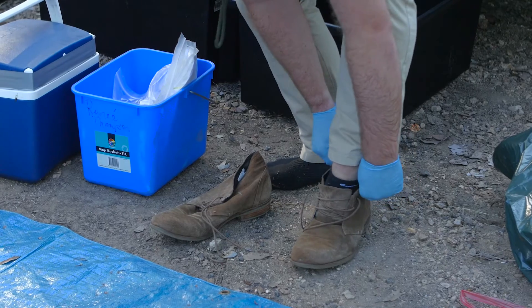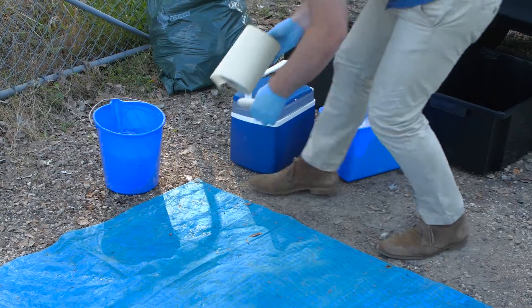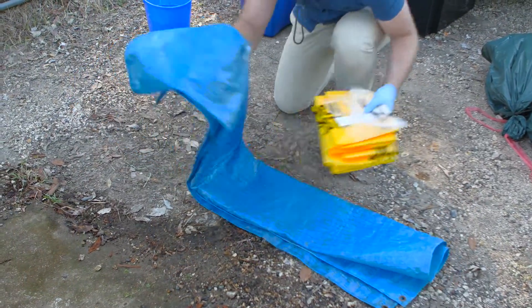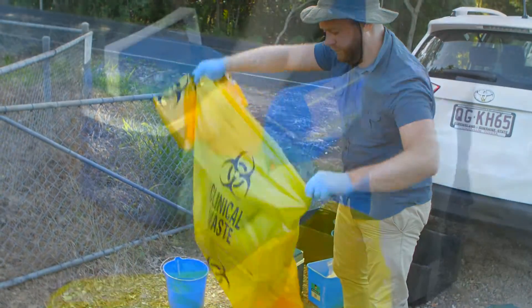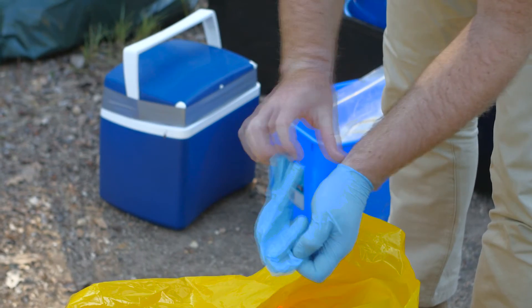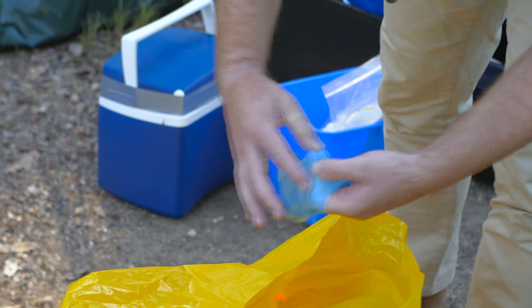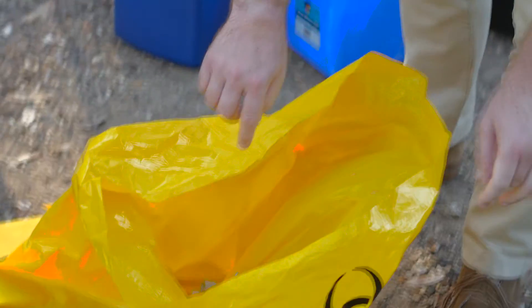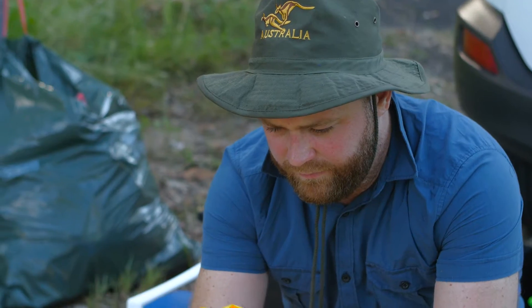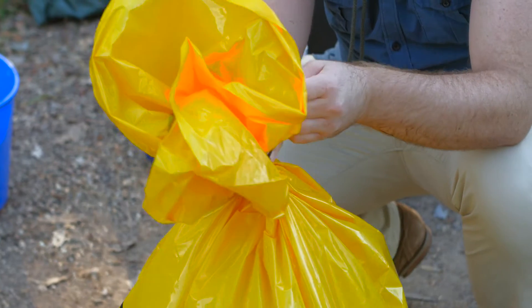Do not cross back into the dirty area for any reason. Carefully, without contaminating your clean clothes, collect and dispose of the disposable drop sheet in the biohazard bag. Remove your remaining inner pair of gloves in the same manner as the first, taking care not to touch the outside of your gloves with your bare hand. Put the remaining pair of gloves in the biohazard bag containing the drop sheet.